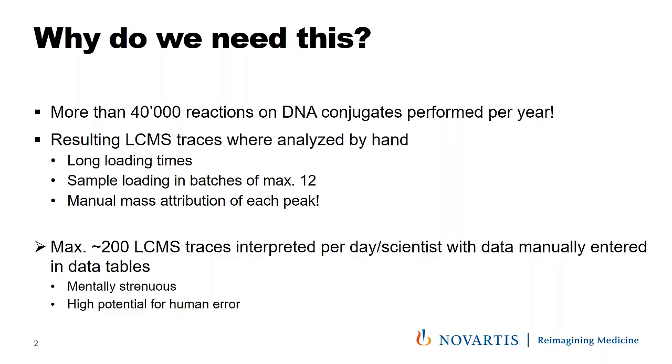And of course, every colleague had his own interpretation style, and this led to different data coming from the same results, making the whole thing somehow inconsistent. Besides this, do I need to tell you how mentally strenuous this task was? I don't even talk about the potential of human error we have here. But now, without further ado, we come to our solution.